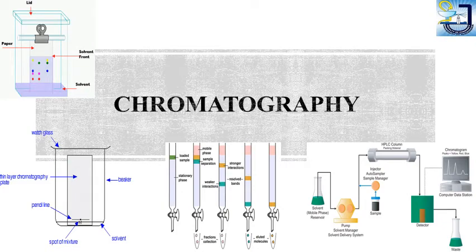Hello. In this section, we are going to give a brief introduction to chromatography. Chromatography is one of the most important analytical methods used in the pharmaceutical industry. It is used for the separation and identification of different chemical compounds in dosage forms.